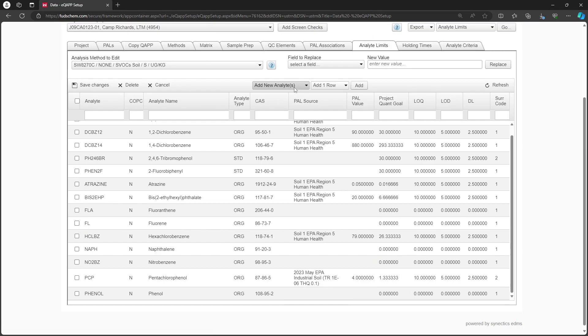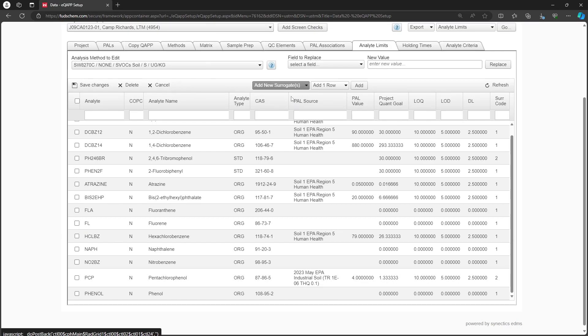We can also add new surrogates. We will change the Add New Analytes drop-down to Add New Surrogates and select the number of rows to add. In this case, one row is sufficient.